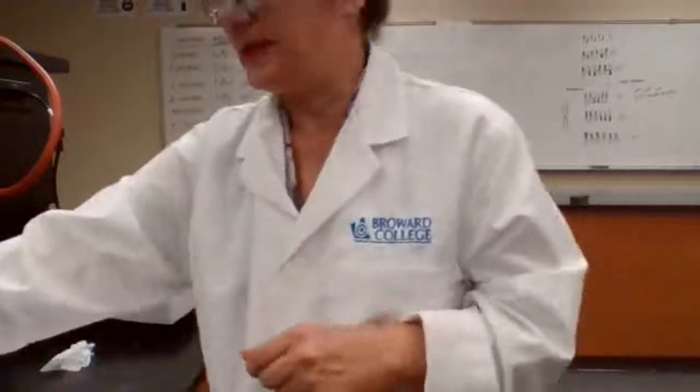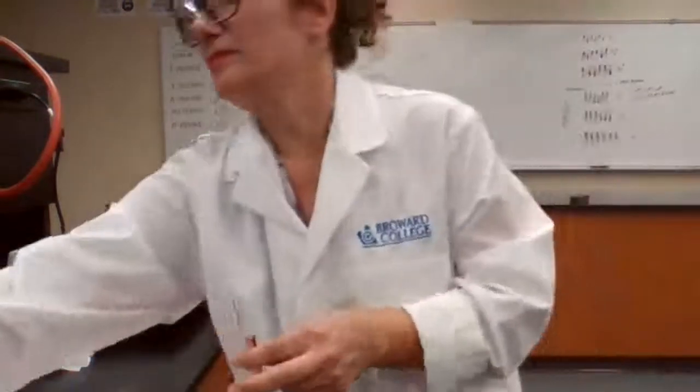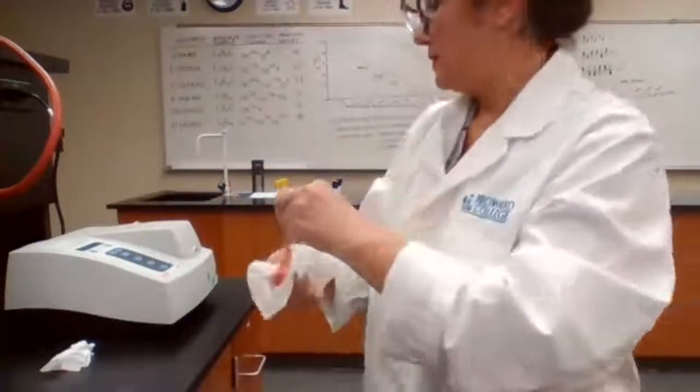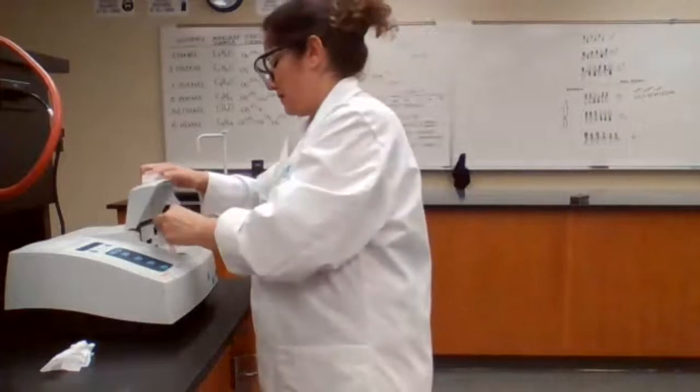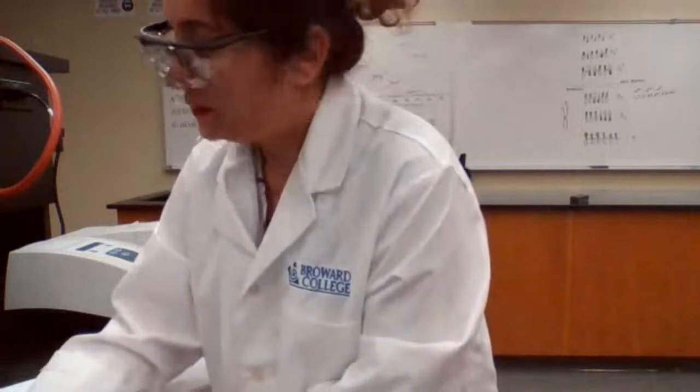Okay, 2:15, and I'm going to use my unknown A. 32.3% T.